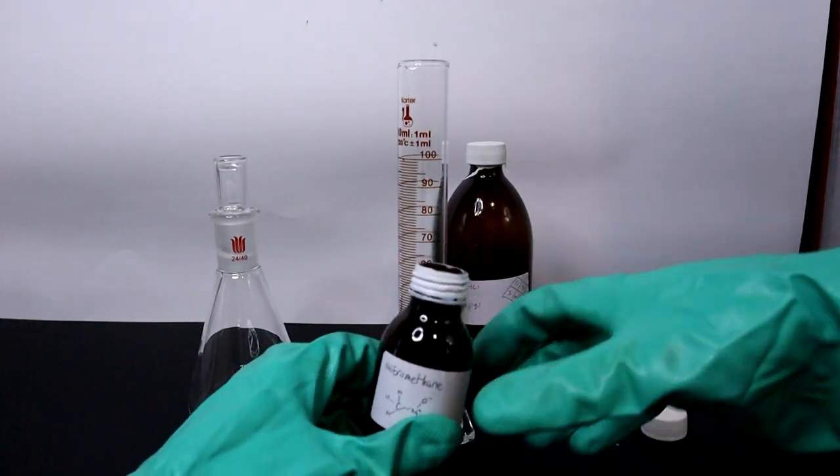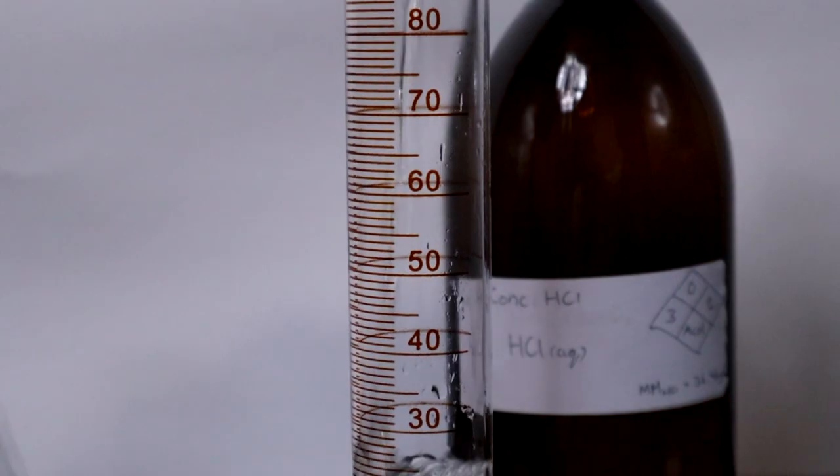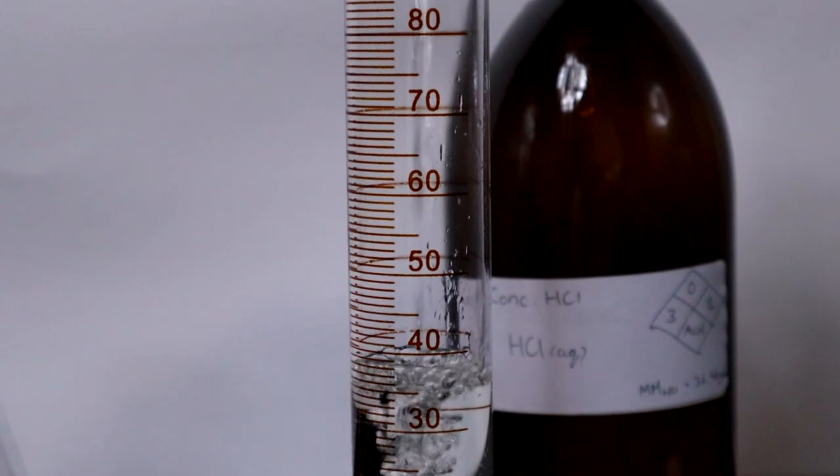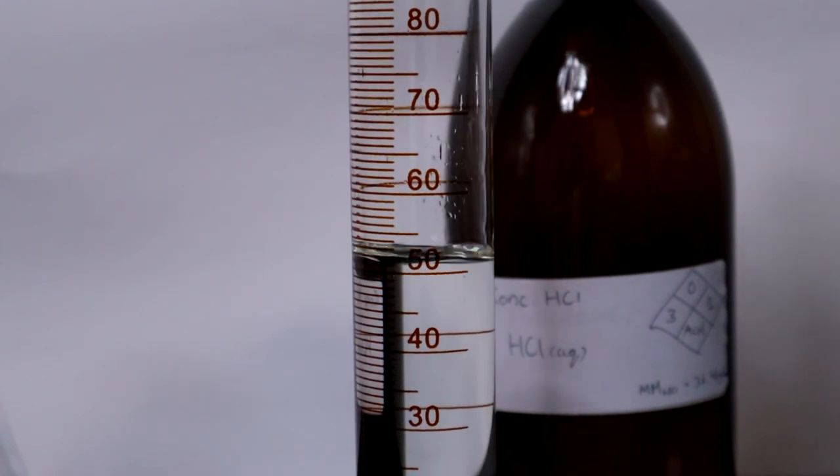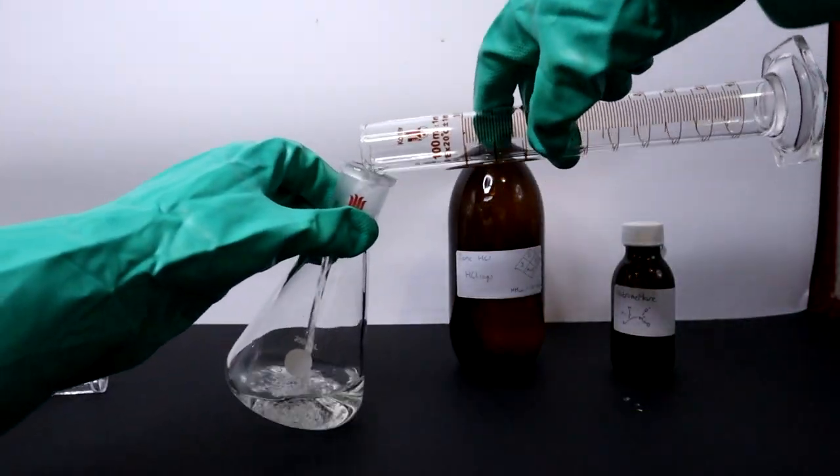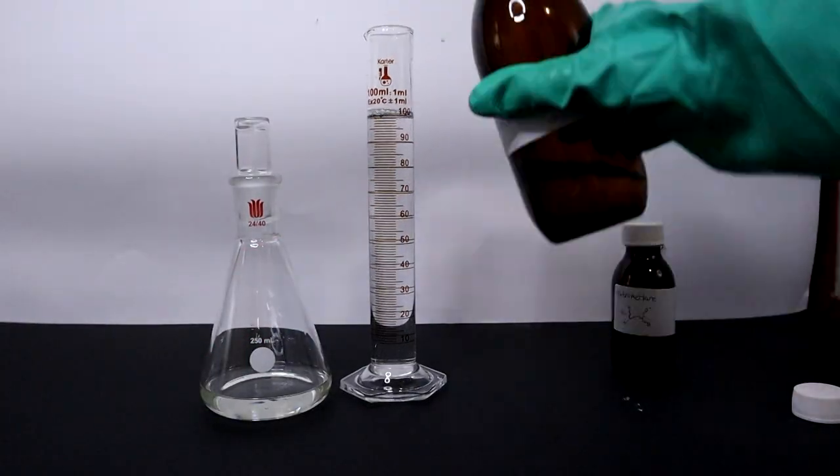I measured out the nitromethane first using a graduated cylinder. Both the nitromethane and hydrochloric acid were then transferred into a 250 milliliter Erlenmeyer flask.